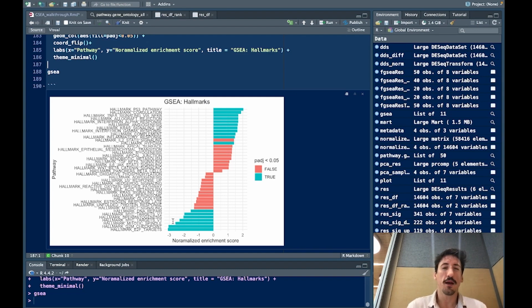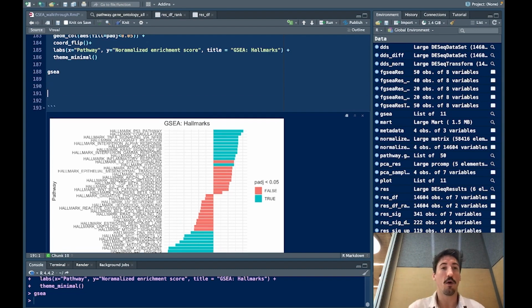And so I'm going to kind of copy the paper that I had referenced in the previous video. This is the paper I was a co-author on. And ultimately, we were focused on the downregulation of G2M checkpoints. So this is looking at a lot of different gene sets, but if you want to focus in on one particular gene set, for instance, G2M, you can actually plot that ranked list chart type thing you see in the initial slide of this video. So I'll kind of show you what that actually means though first.